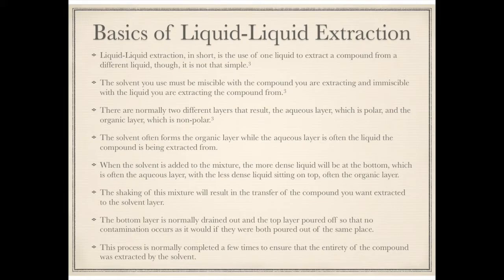The solvent you use must be miscible with the compound you are extracting and immiscible with the liquid you are extracting the compound from. There are normally two different layers that result: the aqueous layer, which is polar, and the organic layer, which is nonpolar.